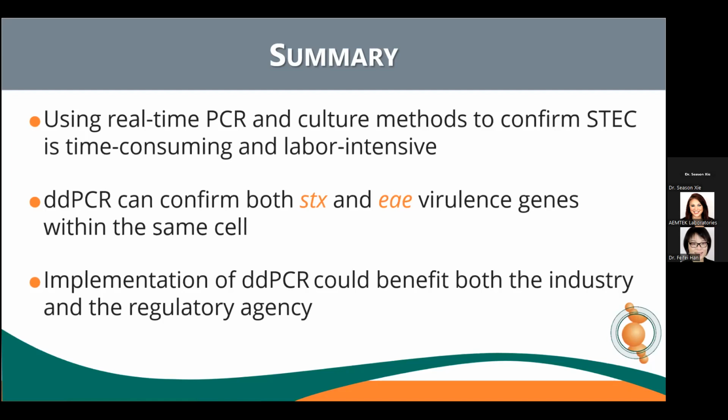The implementation of ddPCR holds great promise for both the food industry and the regulatory agencies by providing more accurate and efficient STEC confirmation. ddPCR can significantly benefit the industry by streamlining testing protocols and improving overall food safety. Regulatory agencies can also leverage ddPCR to enhance their monitoring and surveillance efforts, ensuring better control of STEC-related risk.